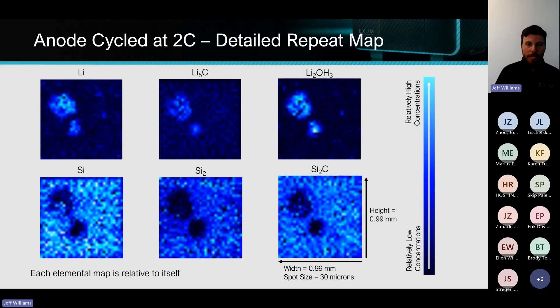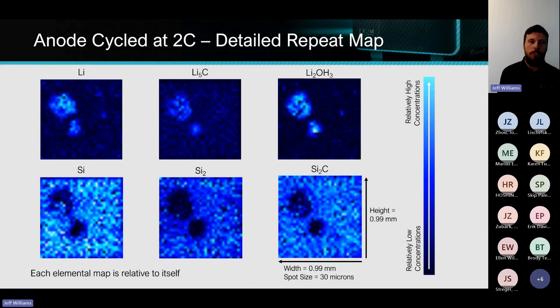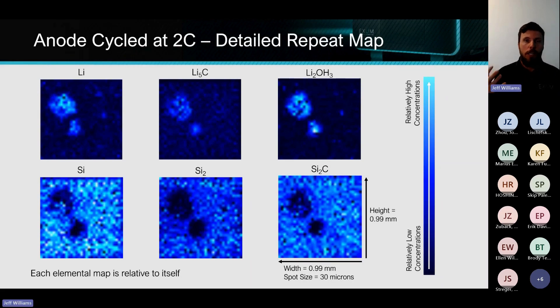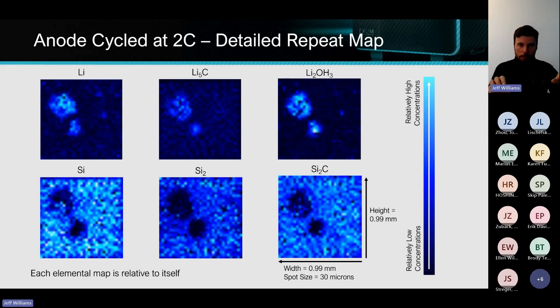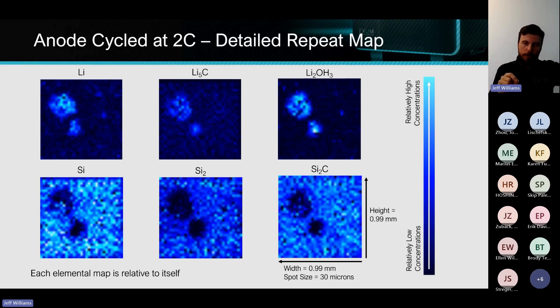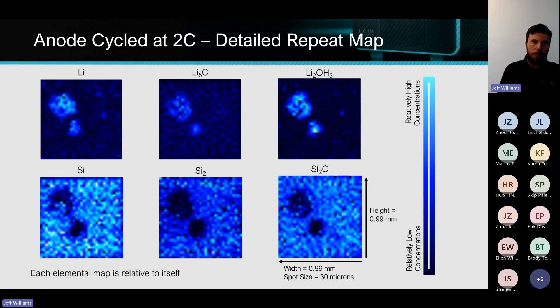By contrast, looking at the zoomed-in 2C data, we're now talking multiple hundreds of microns particle size. We see big holes in the silicon maps across every species of silicon there — and this is what's causing the short circuit.